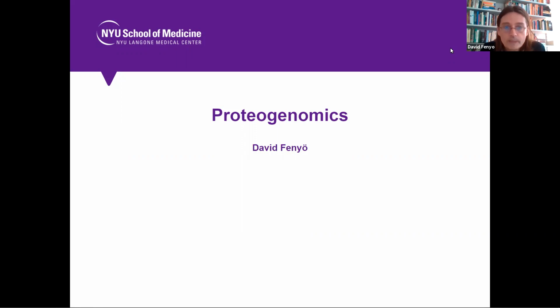Okay, good. So I will talk about proteogenomics. That's when we take proteomics data and combine it with genomics data. Some of you have probably already heard either me or others talk about this a little bit, but there are a lot of aspects that one needs to think about, and there are also lots of opportunities on how to do that.